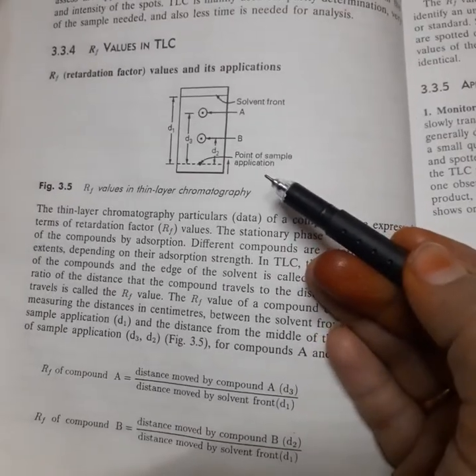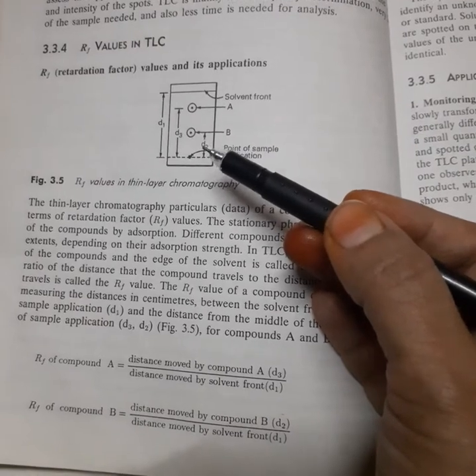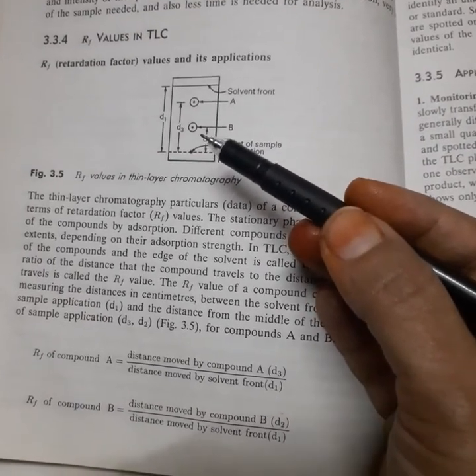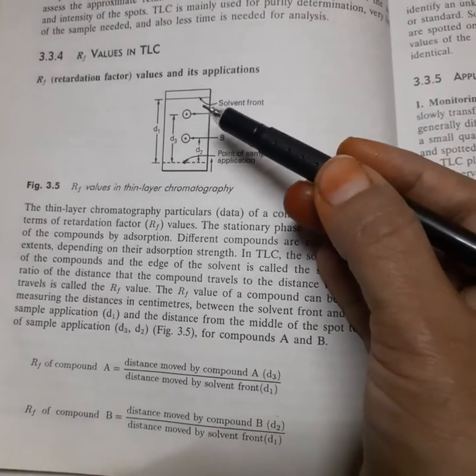And always these RF values depend upon the mobile phase we are selecting and the nature of the adsorbent, that is whether we are using silica gel or alumina G, and also the thickness of the adsorbent coating.